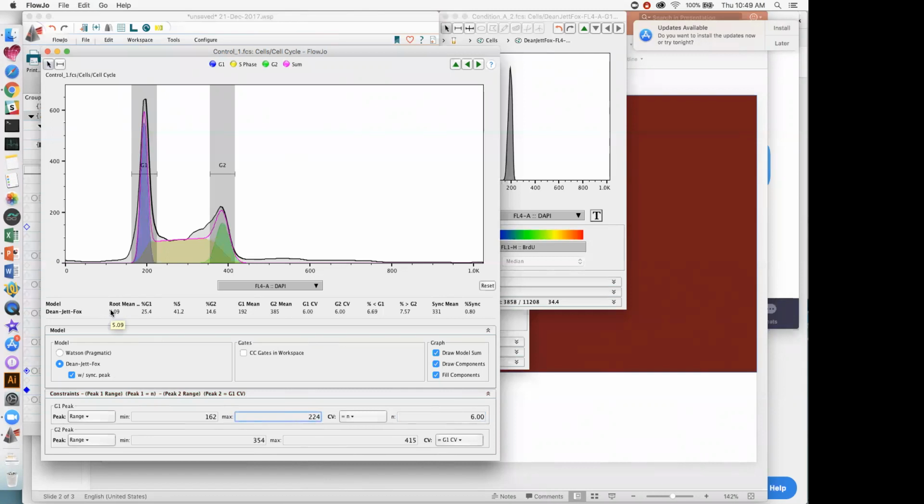From 5 to 6 is a huge jump, right? We've gone 2 points down, which is nice. And then again, as I said, it's really more or less personal taste here. If we're at 7, we get 3.9. If we are at 8, we go up 0.1 units. So that change in the RMS is not that huge between 7 and 8, right? But you are correct, we could say that technically the 7 is a better number because this RMS is minimal when I set it to that value. Okay, but again, it's at that point where the variance is very tiny when I make these changes. It's more or less a matter of personal taste.